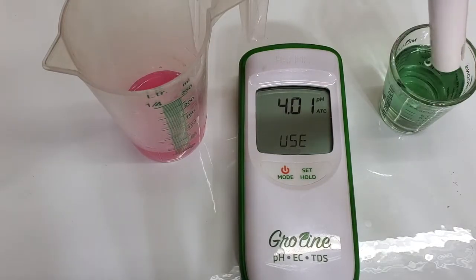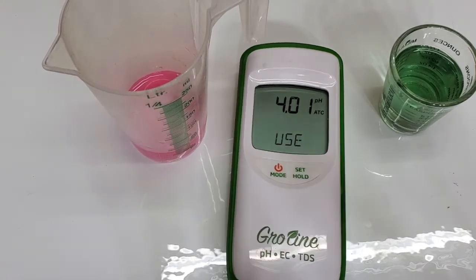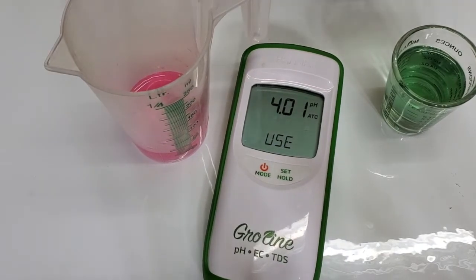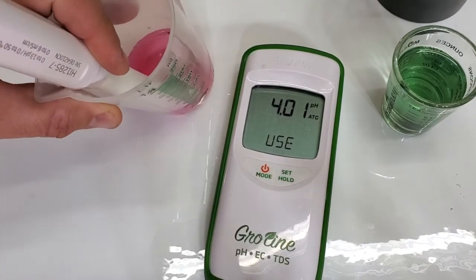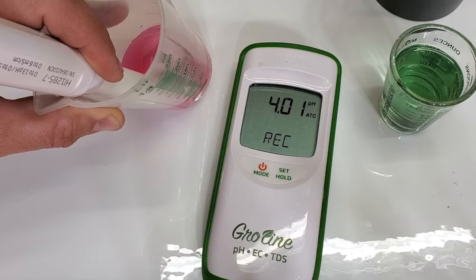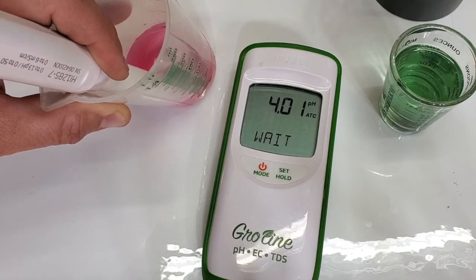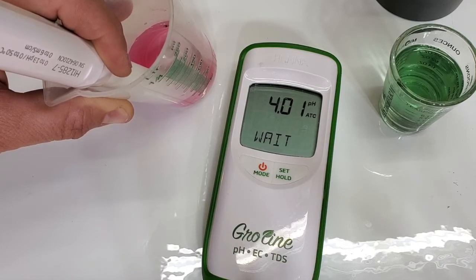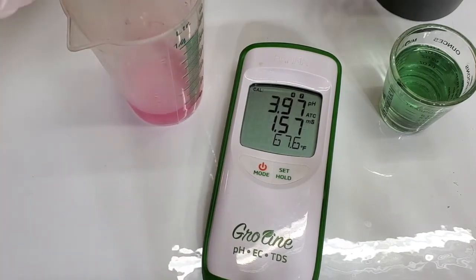Now it's at 4 — we're going to want to rinse it off in between. Now into the 4 solution. Once it's done, it'll just jump back out to the main menu, and you know you're done.